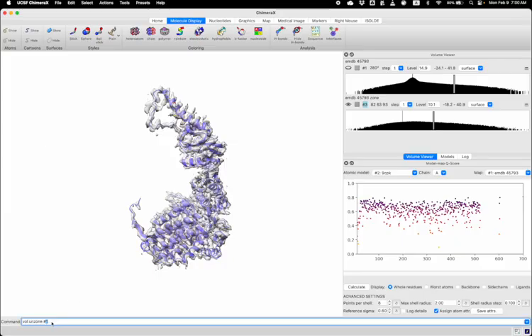And then I can use a command to color code the ribbon. This command is color by attribute, and the attribute name is Q-score. And here I can put range 0 to 1. Q-score typically ranges from 0 to 1. But it's more useful to do something like 0.8 because that's the maximum Q-score here. So Q-scores vary by resolution. At this resolution that we have here, about 2.6, typically the maximum is around 0.8.